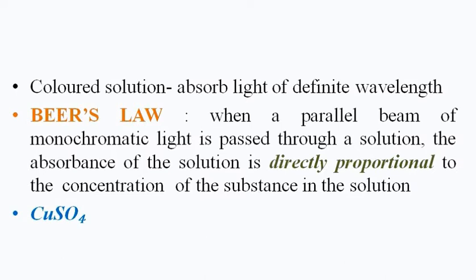So what does Beer's law say? Beer's law states that when a parallel beam of monochromatic light is passed through a solution, the absorbance of the solution is directly proportional to the concentration of the substance in the solution. So what do you mean by monochromatic light? Monochromatic light means light of single wavelength.